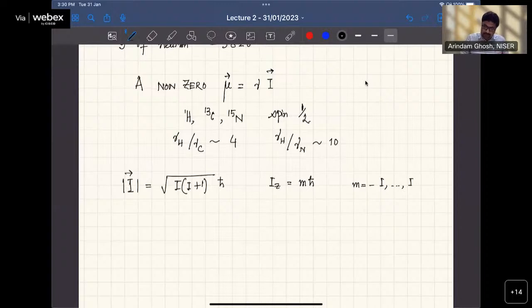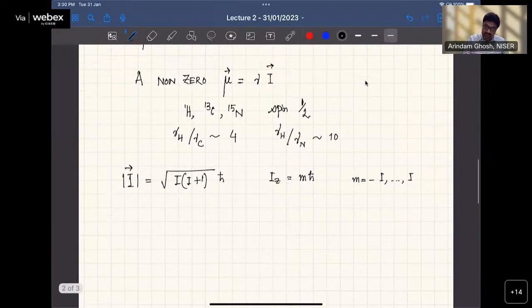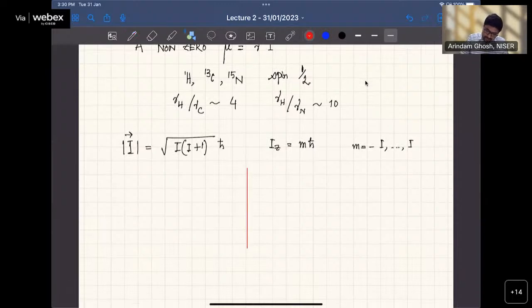This IZ is that if we somehow keep this mu, this magnet, it's just a magnet, although this quantum mechanical magnet doesn't have a north pole and south pole like this, still it is a magnet, it interacts with a magnetic field. If I try to draw a direction, like this is basically B0 or B, the magnetic field. We have to bring a magnetic field in NMR anyway, slowly. And I assume that this is some B0 as a magnitude, and then it is in the Z direction. It's a Z direction magnetic field.